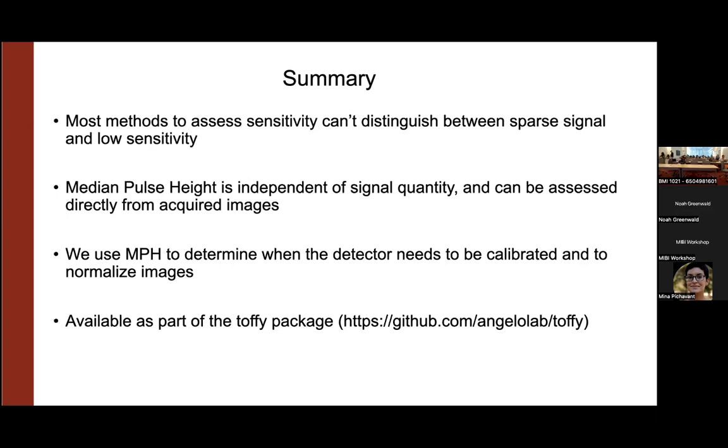Obviously, if you want to use it to determine when to calibrate the detector, you need to do it in real time. But if you're relying on IonPath for the detector calibration and just want to use this for normalization, then you can do it at any point.